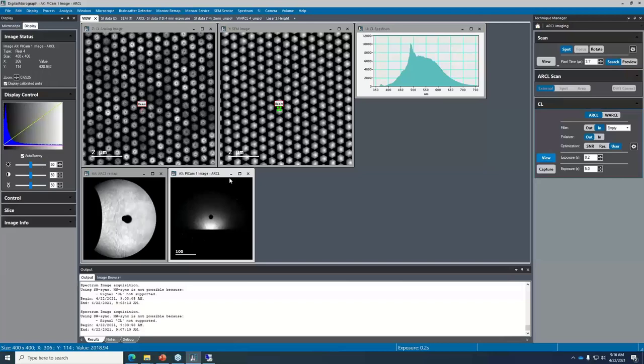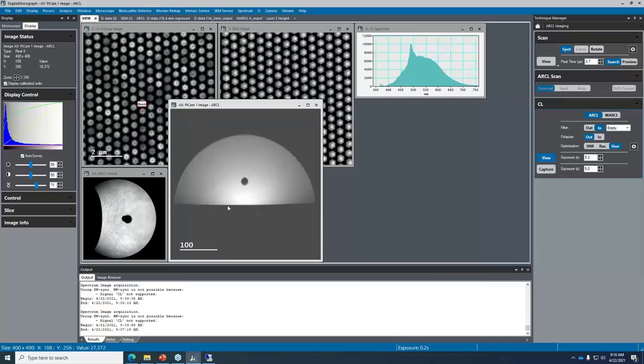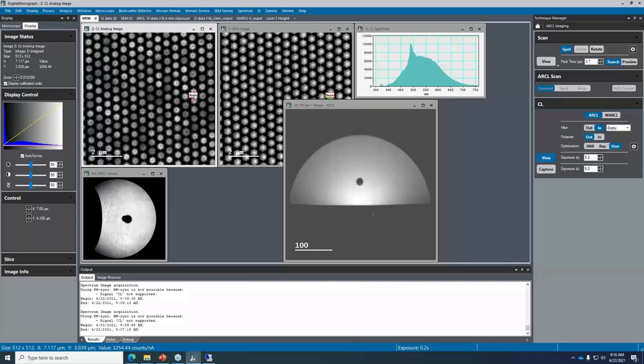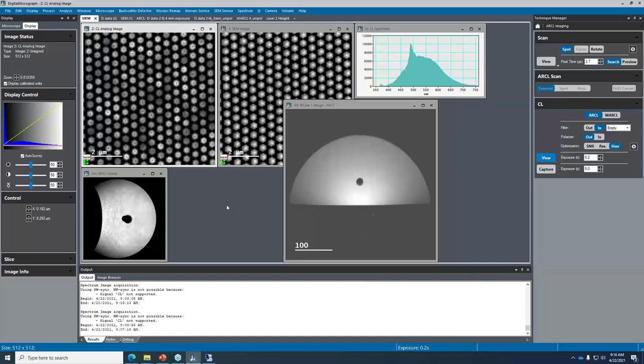This is a perfect image of the back plane of the mirror, telling us that the system has automatically located the specimen at the correct position. The characteristic of the back plane image is that it's flat on the bottom and not greatly deformed. If we were to move up or down in Z, or move outside, you start to see deformation — the edges start to curve inward and the transform adjusts. This confirms the automated alignment has positioned the sample correctly.